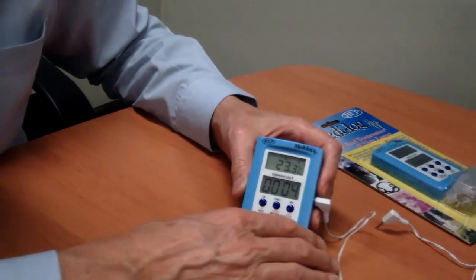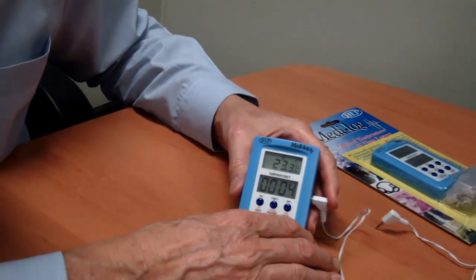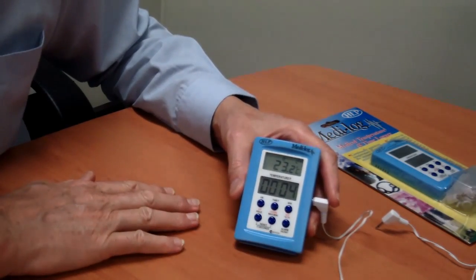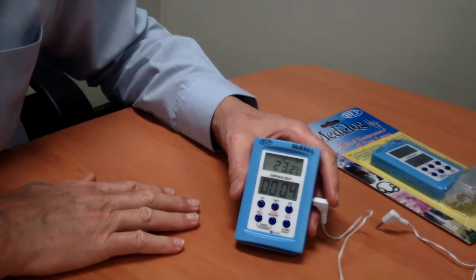So that's the Medi-Log, that's how it works. Very simple to use and very versatile in monitoring vaccine temperatures. Thanks.